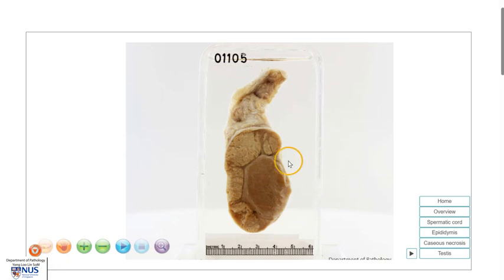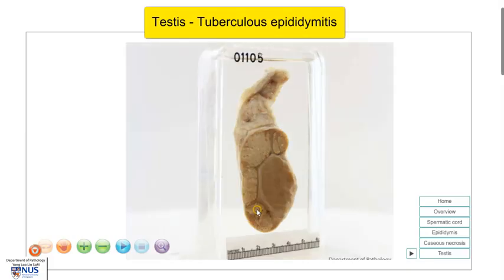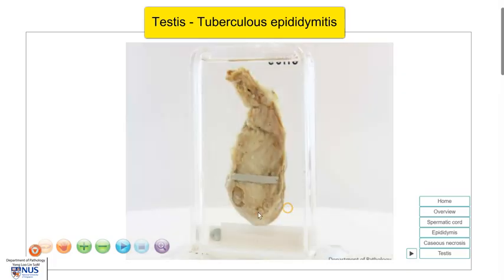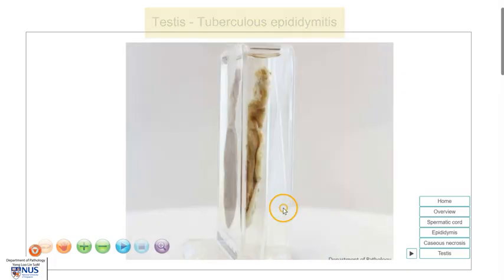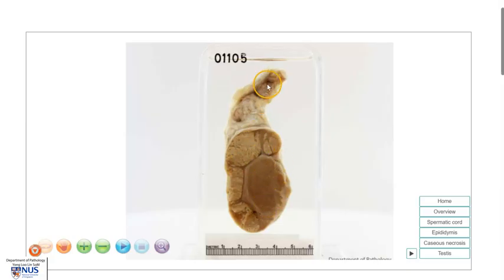Hello. This is a virtual pathology specimen of a case of tuberculosis epididymitis. We are looking at the cut section of a testis. Just to orientate ourselves, this is the testis, the epididymis, and the spermatic cord.